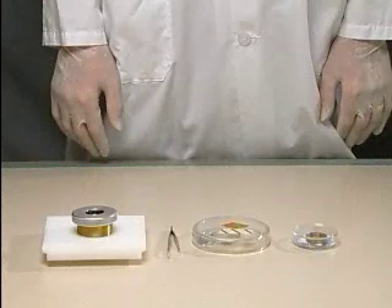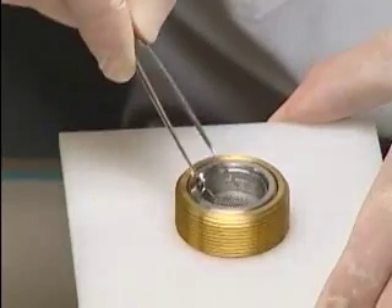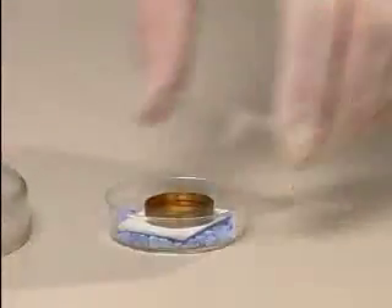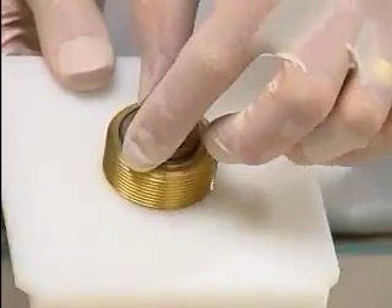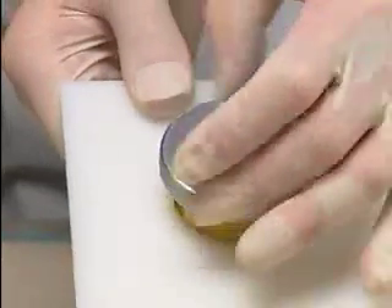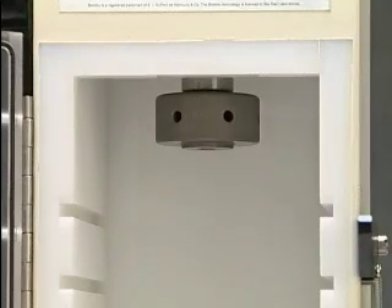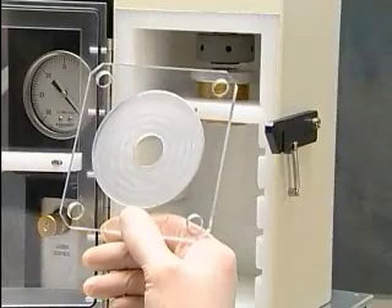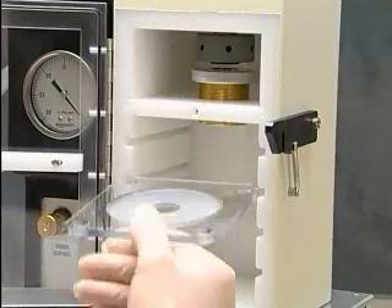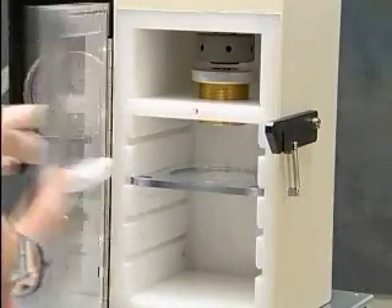Press the microcarrier launch assembly into place. Place a sterile stopping screen on the stopping screen support. Install the macrocarrier holder containing the loaded macrocarrier on the top rim of the fixed nest, with the dried microcarriers facing down towards the stopping screen. Replace the macrocarrier cover lid on the assembly and tighten. Place the microcarrier launch assembly in the top slot inside the bombardment chamber. Place the target shelf at the desired level inside the chamber, place the sample on the target shelf, then close and latch the chamber door.